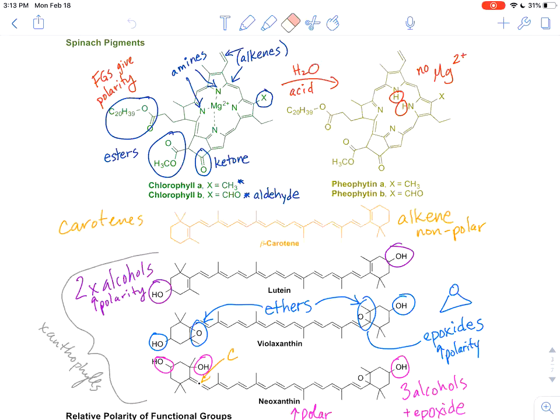In lecture, and also in the experiment 3 PDF, you were given the structures of all of the pigments that you may see on your TLC plate. Now, some of them may have separated, some may not. And again, I started with the plate that has the most spots.